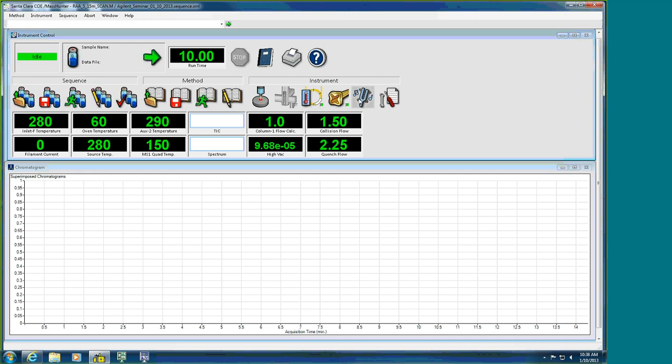And the point of this MassHunter Bootcamp Acquisition setup class is to demystify MassHunter acquisition and let you know that it will be a very simple transition if you want to go from ChemStation to MassHunter.